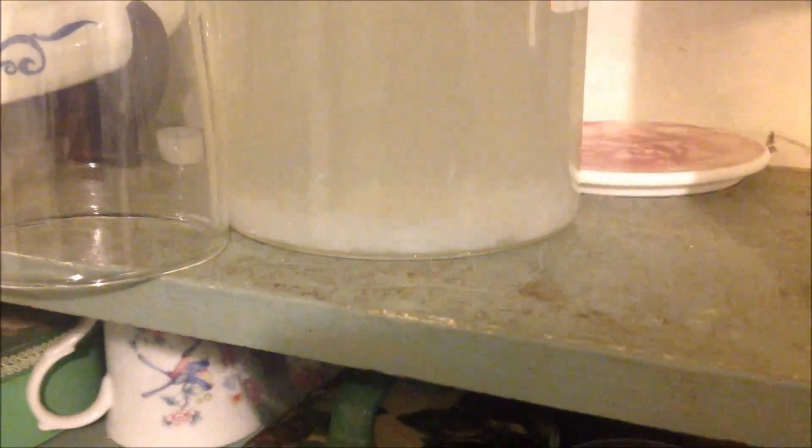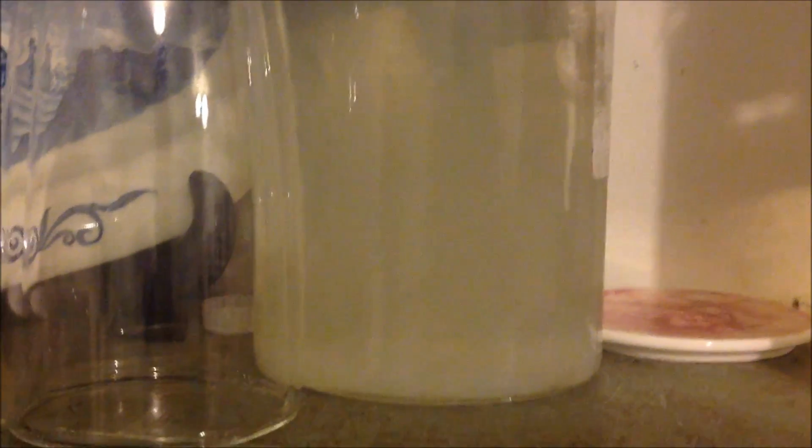You can also see there's quite a bit of precipitate in the bottom of the jar. It's a bit murky otherwise, and the pH is still below 2 at this point, so that's interesting.